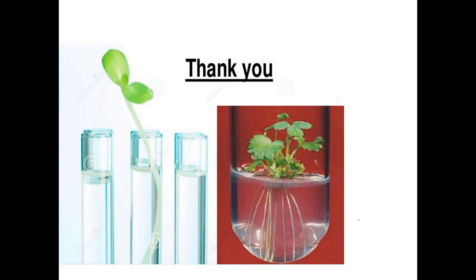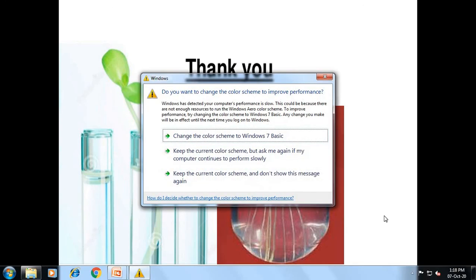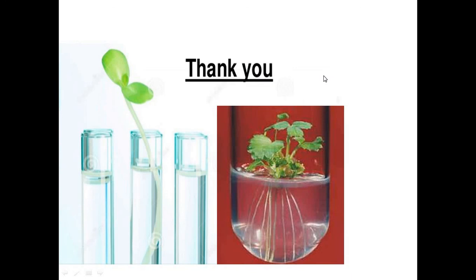So this is what I wanted to discuss with you today about the basic principle of tissue culture, that is totipotency. Then preparation of media, which is composed of macronutrients, micronutrients, vitamins and hormones, along with a source of carbohydrate, that is sugar, and a solidifying agent. And the last, the use of nutrient medium and its sterilization. In the next lecture we will go to the other steps for the success of tissue culture. Thank you.